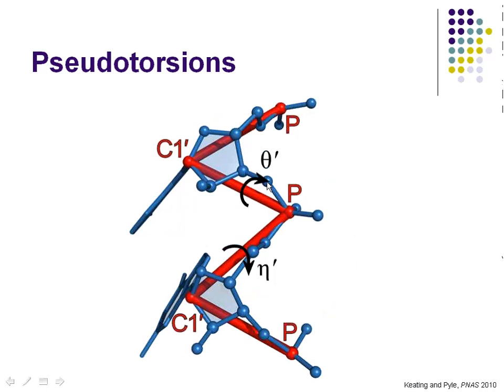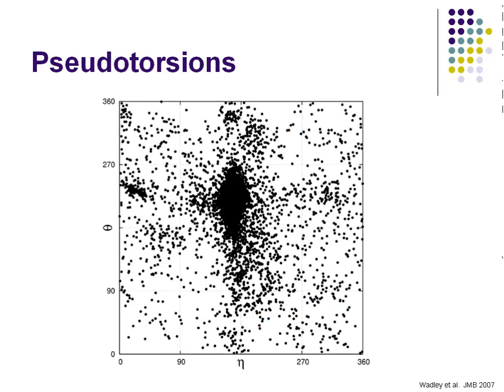If you take these two pseudotorsions, you can do the same things with them that you can do with, say, a protein Ramachandran plot. You have 2 numbers that represent each nucleotide, so you can plot them in 2 dimensions, and the plot can tell you things about your structure. In the past, we've used this a lot to analyze existing crystal structures. Here, obviously, I'm using it to build new crystal structures, but I wanted to give you some idea of where this means of analysis came from.